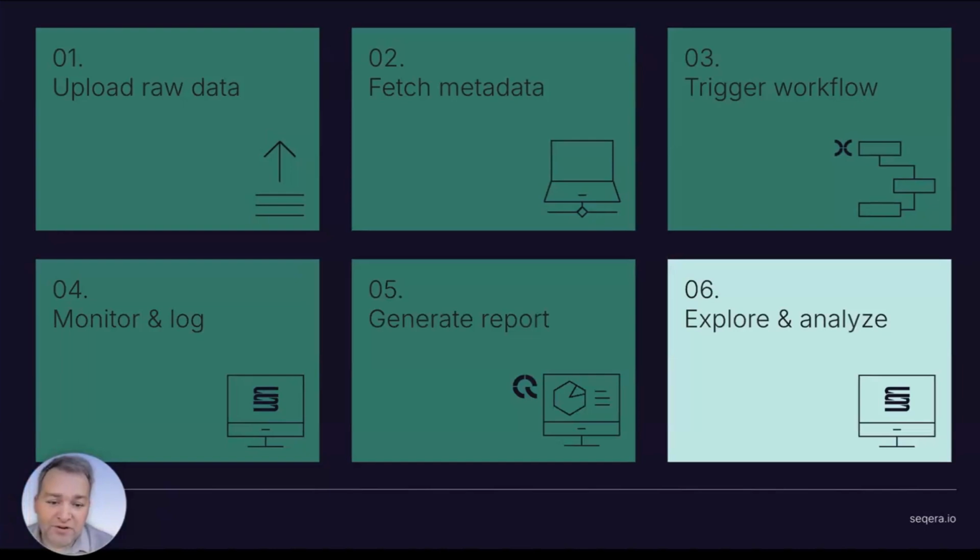And finally, we're going to showcase how you can use a tool called Seqera Data Studios to set up an environment for people to do exploratory follow-on analysis, because this is science that is often always going to be a component, even when you are automating as many of these things as you can.